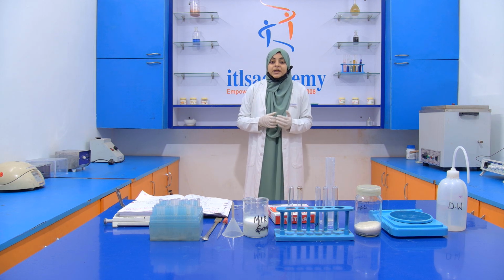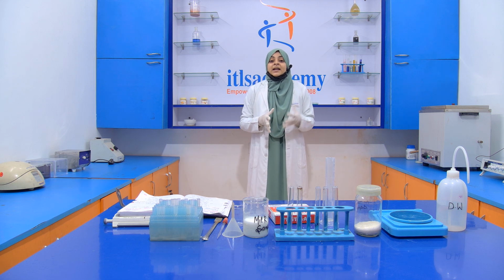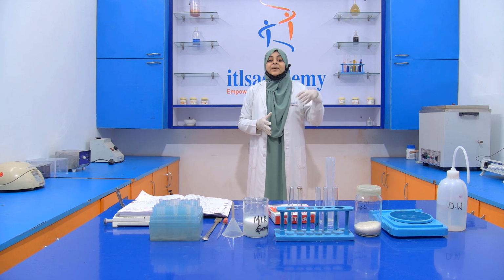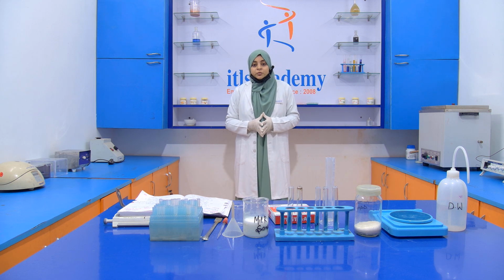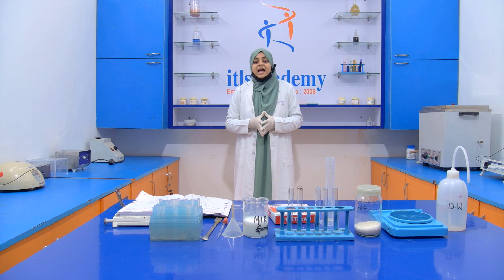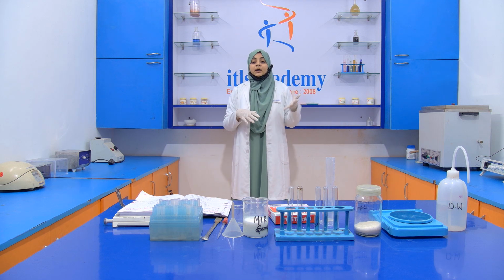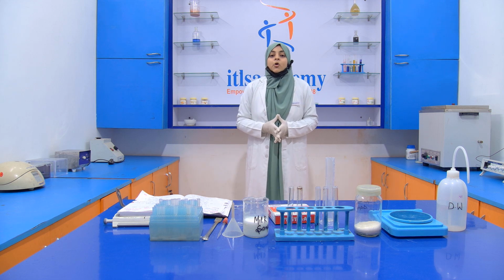So here what we have to do is check whether our milk sample is properly sterilized or not. Usually milk is pasteurized, which means the elimination of pathogenic microorganisms.